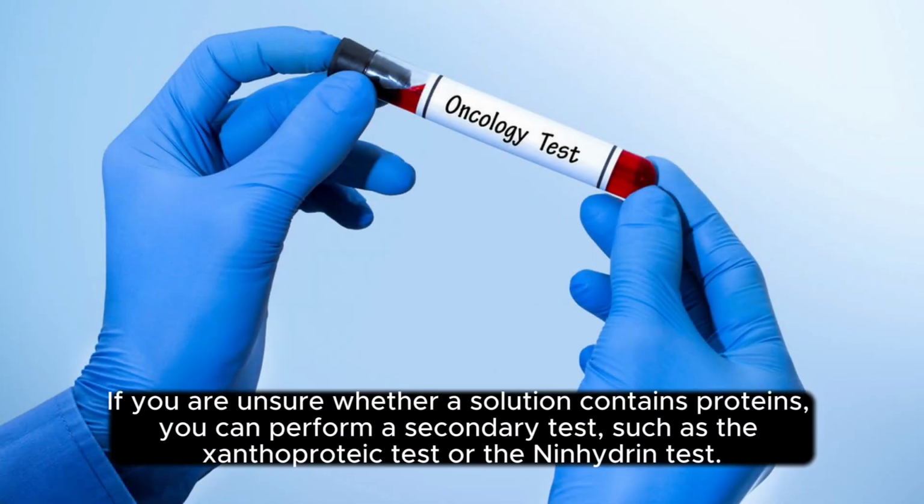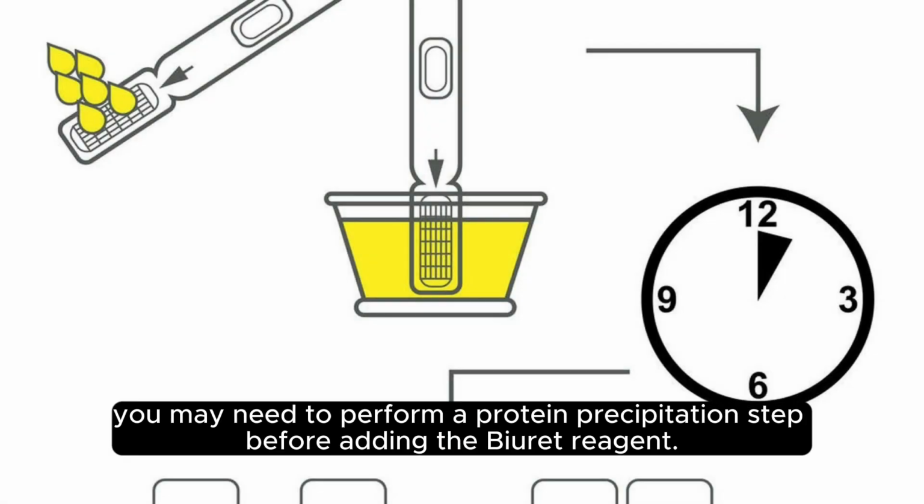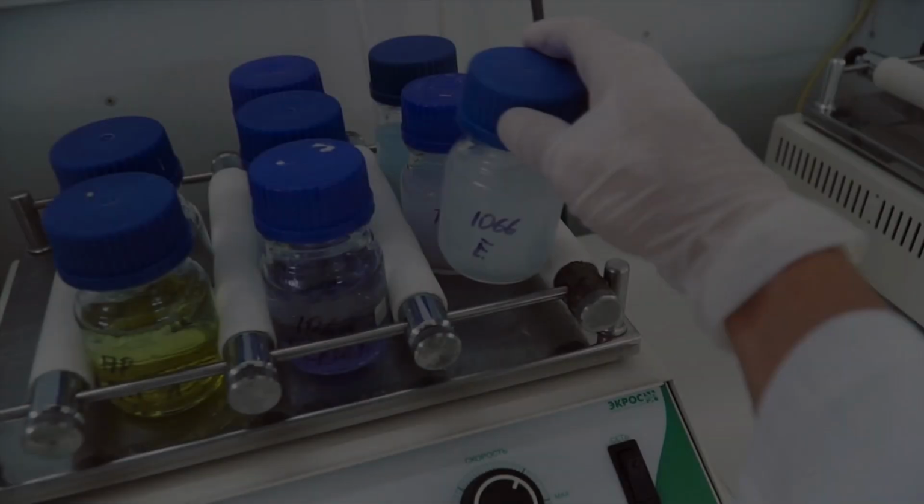Tips: if you are unsure whether a solution contains proteins, you can perform a secondary test, such as the xanthoproteic test or the ninhydrin test. If you are testing a solution that contains other substances, such as carbohydrates or fats, you may need to perform a protein precipitation step before adding the biuret reagent. This will remove the other substances from the solution and leave only the proteins.